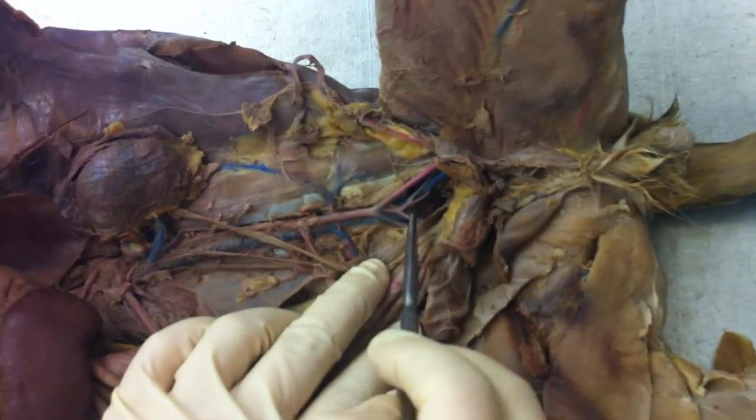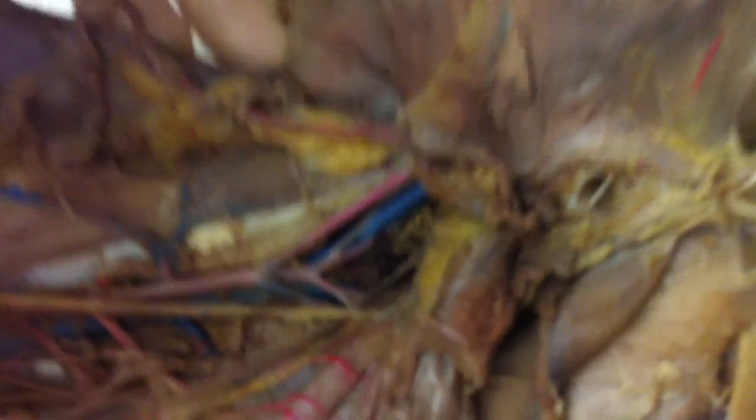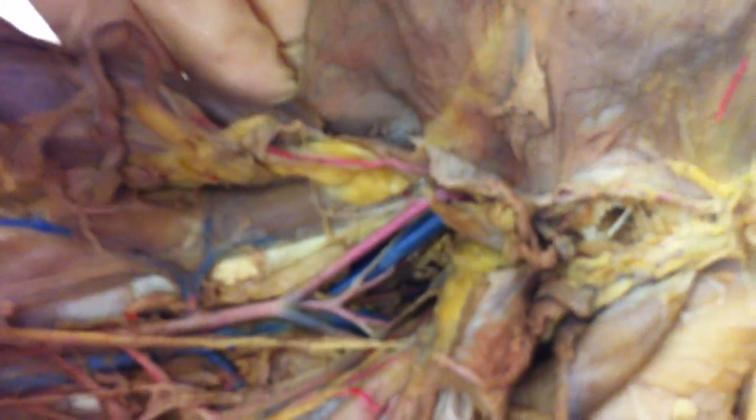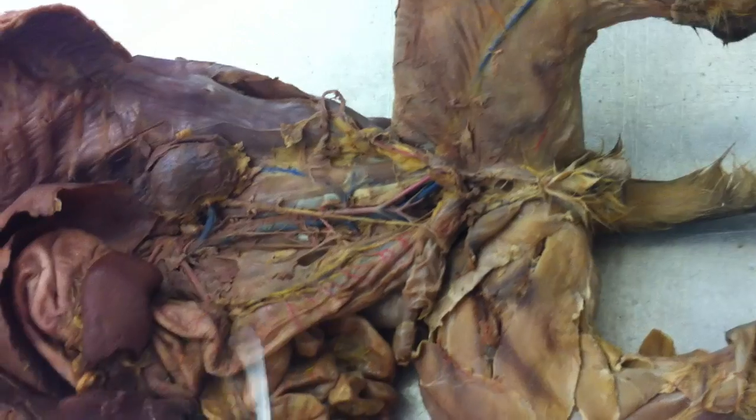In between, and here's the internal one, right? In between, can you guys see that little one? You might have to really look in there. That one's going straight down. That is the caudal artery. Okay? So let's start on some veins up here at the top.